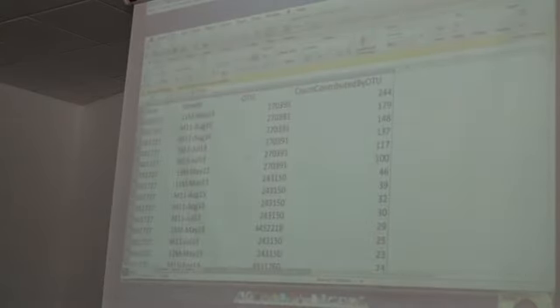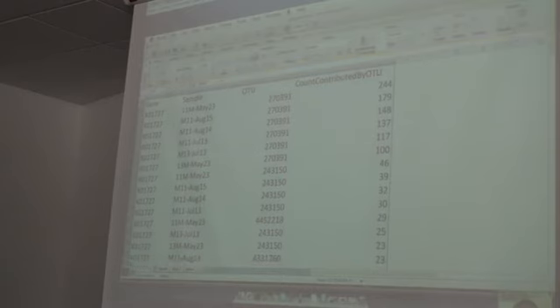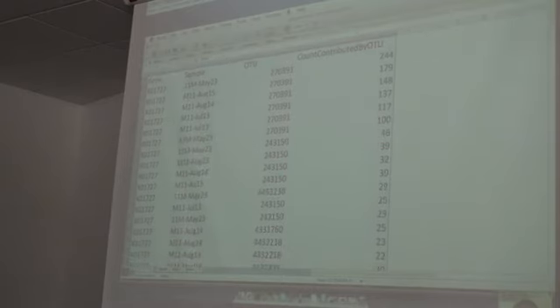This takes a few minutes, so I'm going to do the cooking show thing where they put it in the oven and take out the baked one. This just spits out a tab delimited file. The format is not a standard file format, I guess, but it is tab delimited, so you can open this in an Excel spreadsheet. And so I went through this yesterday and just made it larger and a little bit cleaner format. There are other columns in here, but I've just highlighted the most important ones.